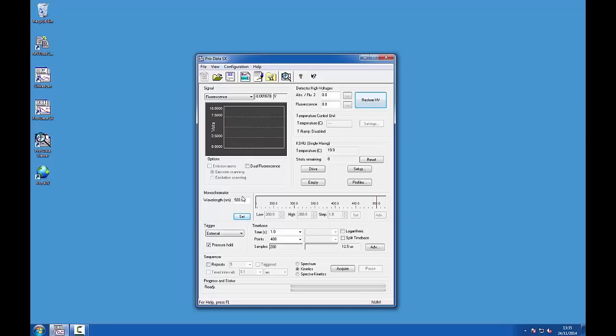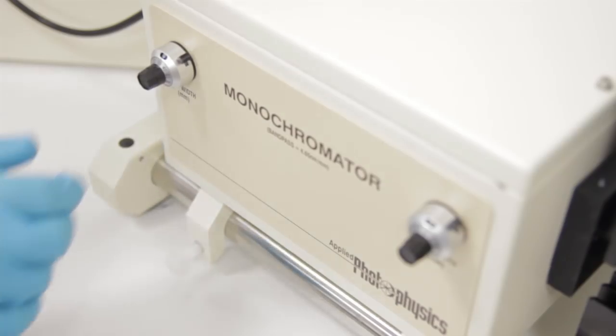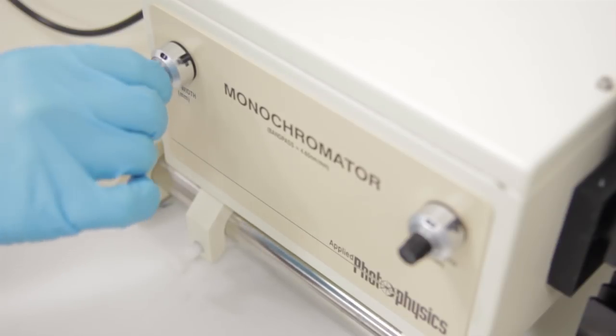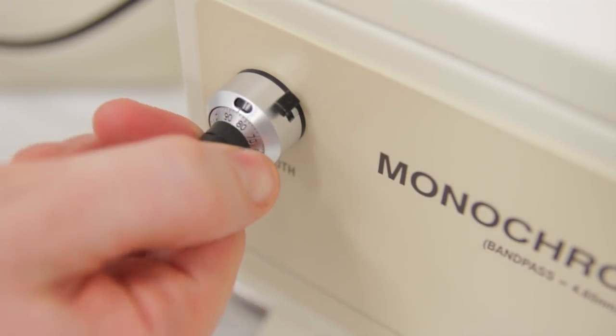Use the spectrometer control panel to set the wavelength to your desired value. Fluorescence measurements generally require more light than do absorbance, so it is often necessary to increase the slit settings on the monochromator. Slit settings of two millimeters and above are generally used for fluorescence experiments.